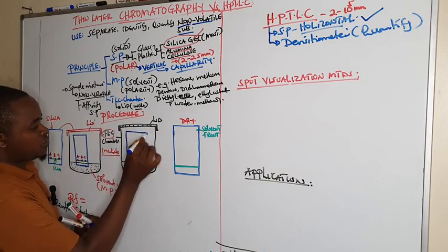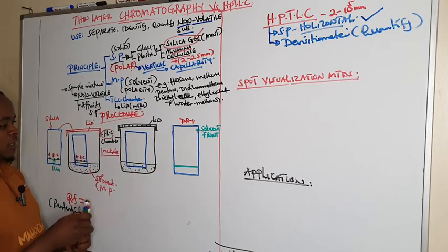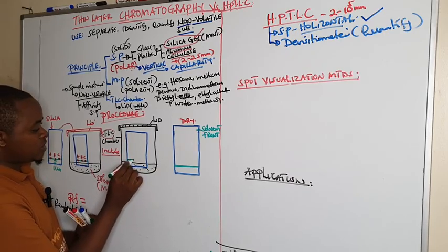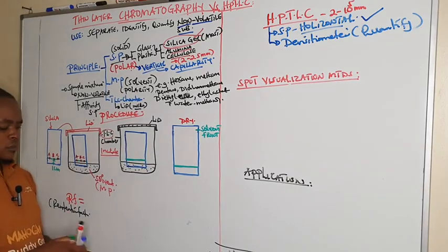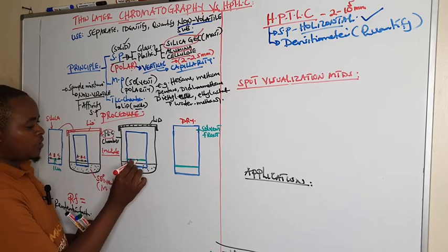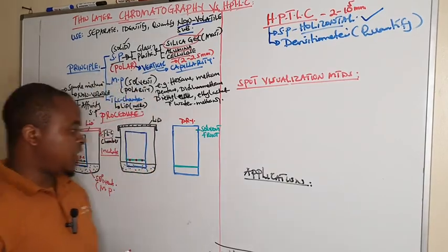during incubation, remember the ink or the dyes containing the compounds to be separated was here, a little bit above the solvent. So we are going to see these spots migrating depending on their affinity to the stationary phase.